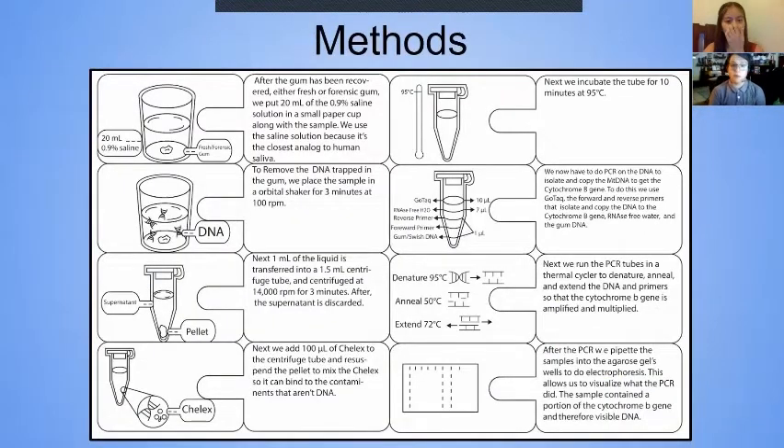To analyze our gum samples, we first submerged the chewed gum within a saline solution. Then we vortex, centrifuge, and chelex our samples, removing the gum contaminants and leaving the DNA of the chewer intact.